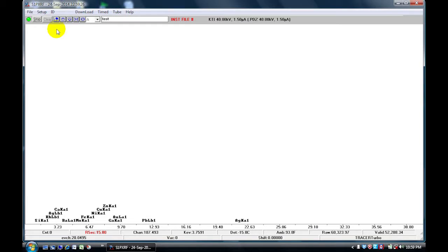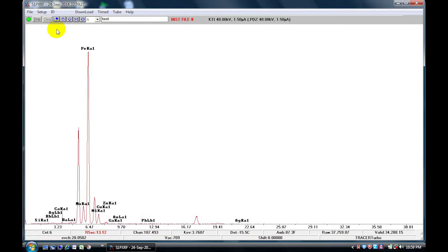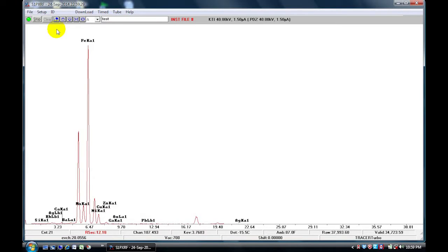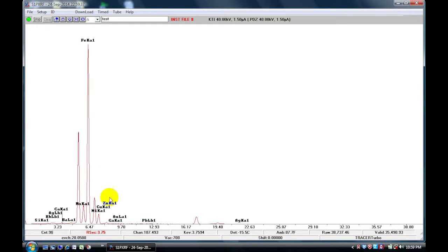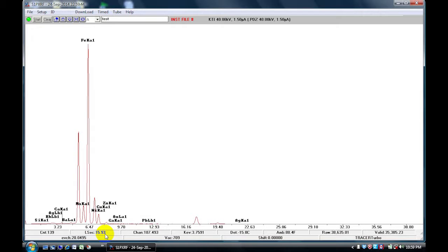Then you just activate your x-ray tube either by the PC trigger, by the handle, or by the remote controller. Notice that the time counts down from our acquisition time, 15 seconds to zero, and when it's completed it will turn black.